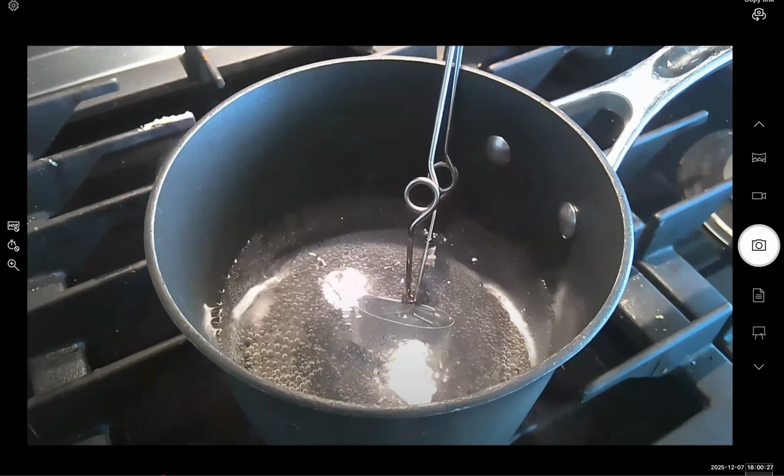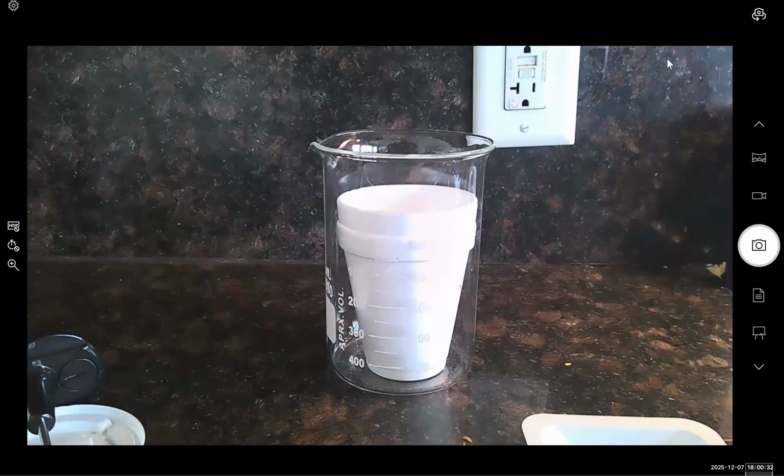So now we have our heated metal piece. We have our calorimeter ready to receive the heated metal piece. And we're going to transfer the heated metal piece into our coffee cup calorimeter.